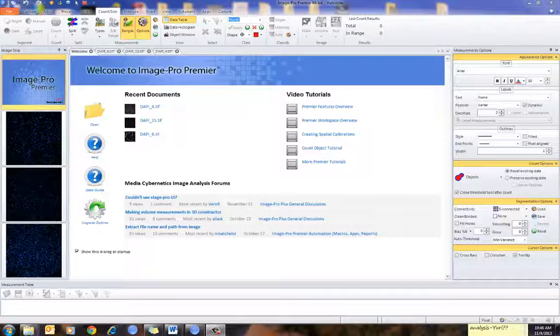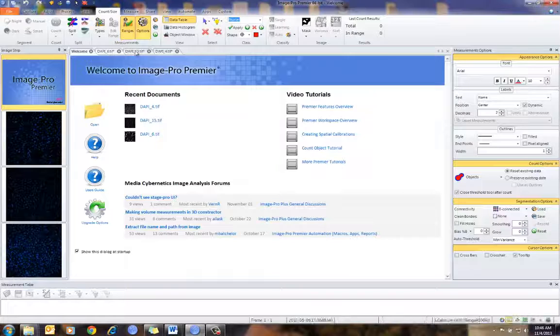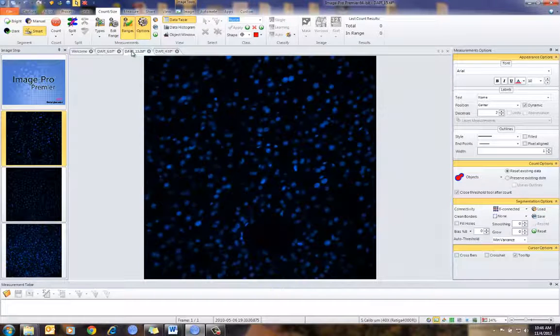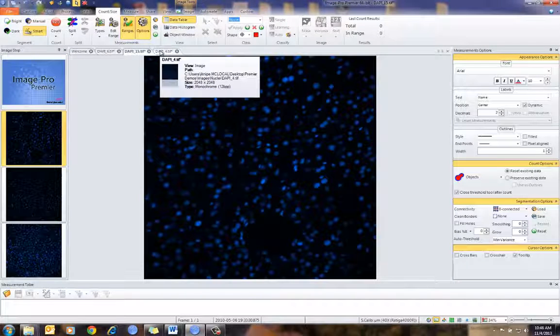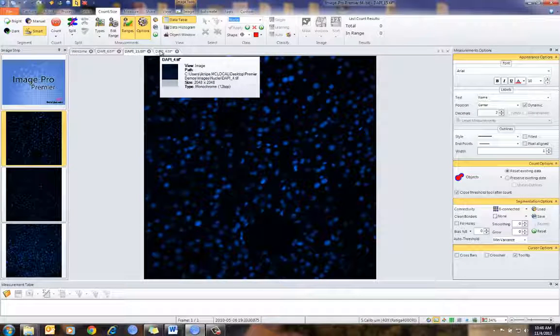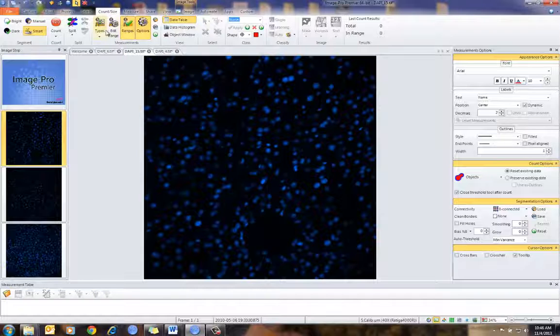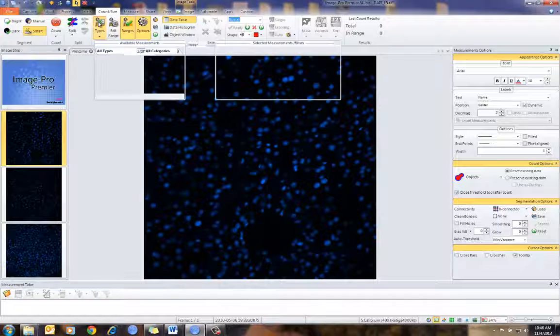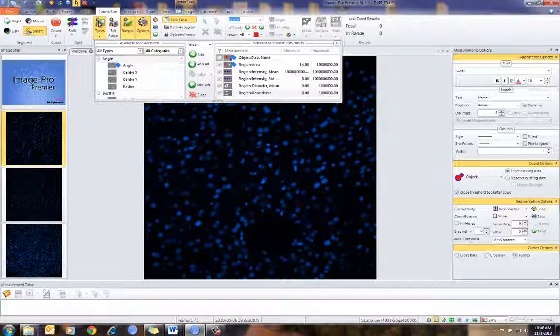So at this point, I'm going to go to Count and Size and show you the images I have already counted. These are nuclei, and I already have Count and Size set up. In this case, I already have the types of measurements I would like to make.